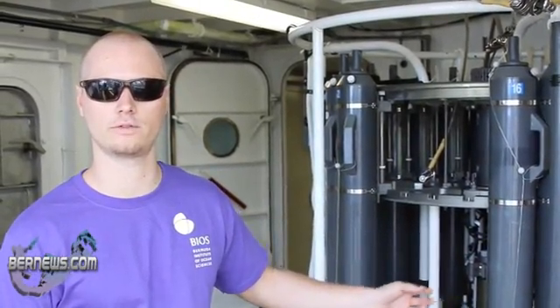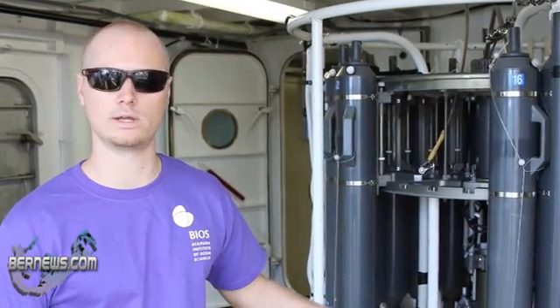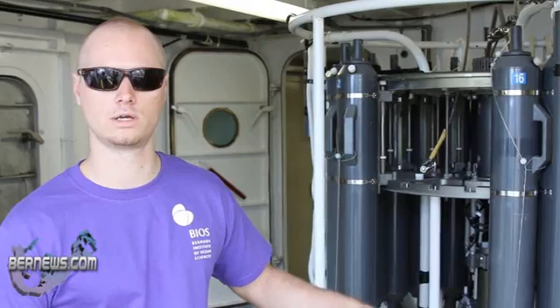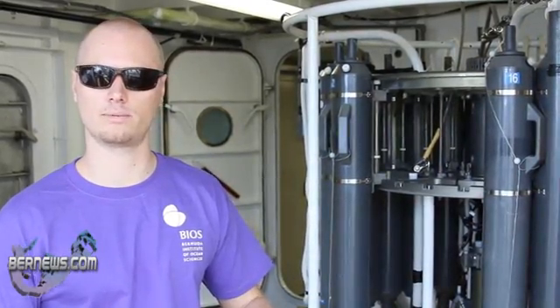The biggest part of this is the water sampling. These bottles that you see are surrounding this instrument. We cock the bottles before we send it down in the ocean — we'll open them and send the instrument down to a certain depth.